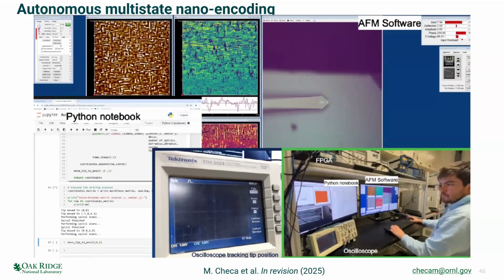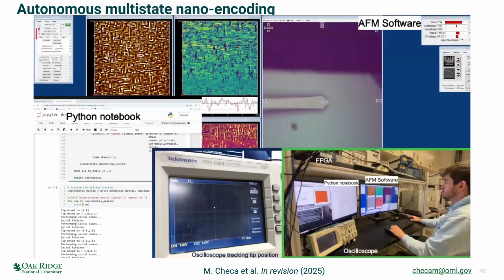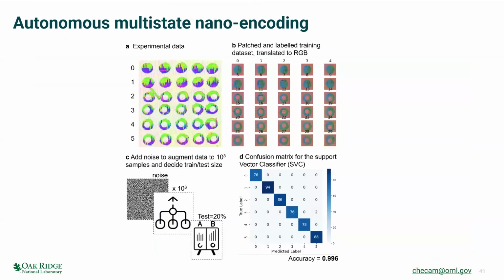It's a slow process, right? This is super slow compared to any hard drive or anything like that. I like to think that we don't only have to think in terms of speed. So, for example, ferroelectrics have a very high Curie temperature, and they're very good with radiation and stuff. So maybe it could be good for possible hard drives that need to go to space or need to work in harsh conditions. So, well, this keeps going for a little bit. I probably don't want to have you sit here just watch me play with the AFM.